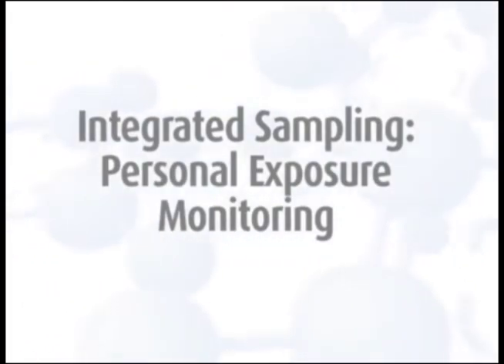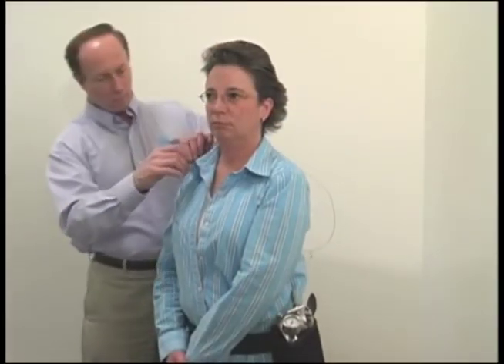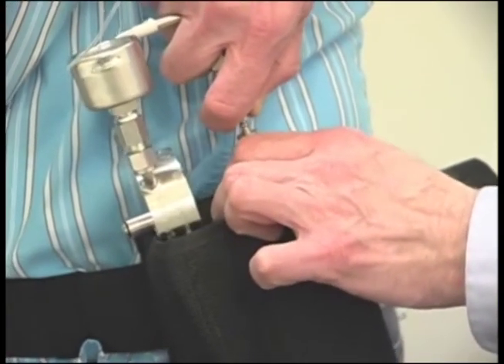If you are going to take a personal exposure sample, you should use the 400cc size with the tubing and belt holster combination. Place the can in the belt holster and clip to the worker. Pin the sampling tube to the lapel of the worker and attach the regulator to the can.